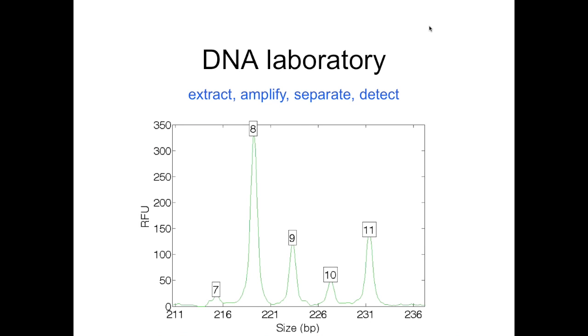So in your laboratory, you'd begin by taking the shotgun shells, you'd swab them, extract the DNA, amplify the DNA material with PCR, separate them out on a DNA sequencer, and detect the peaks on a genetic analyzer. And what you'd see is the sort of data that we had in this case, which is a complex pattern that's clearly a mixture of more than one person, given the number and complexity of the alleles. So that's our starting point. That's the data.